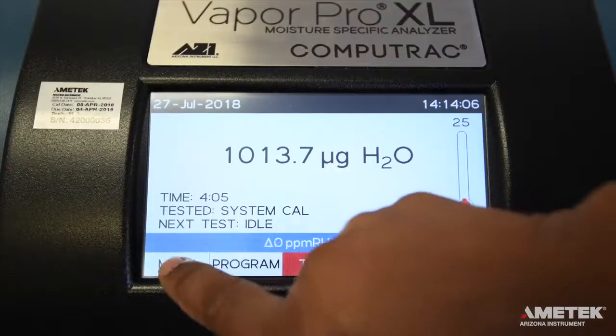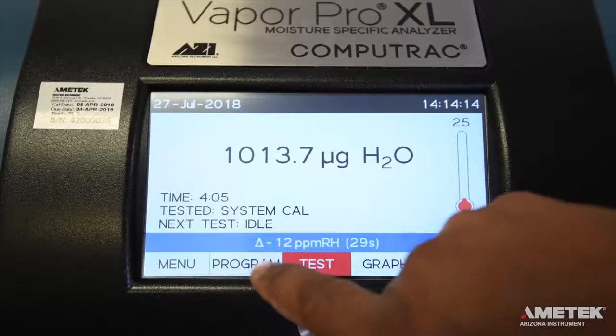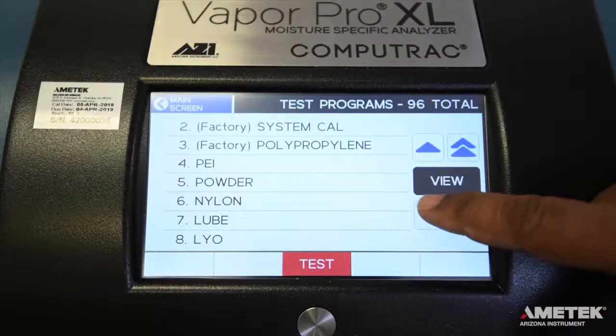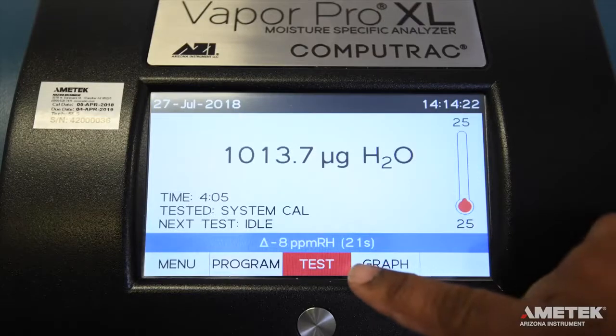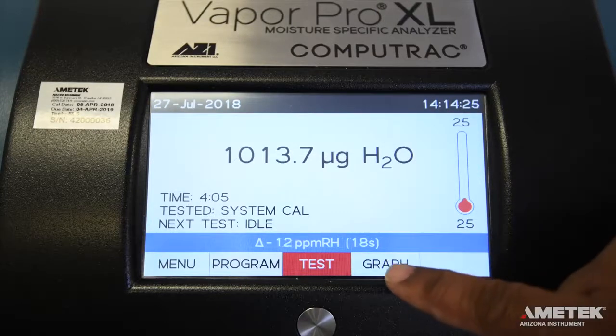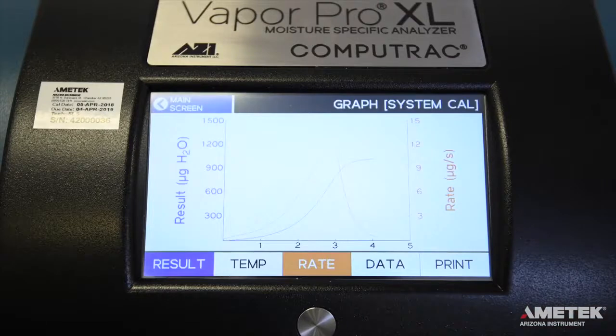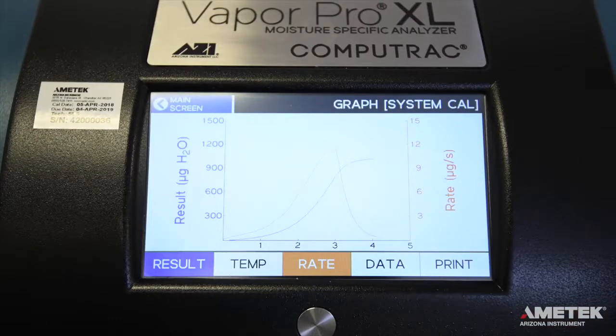Menu will take you to the main menu of the instrument, while program takes you to a list of programs that have already been added to the instrument. The test button is used to begin the next test, and graph shows you the graph of the currently running test or previously run test if there is no test currently running.